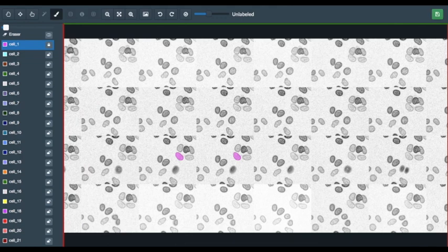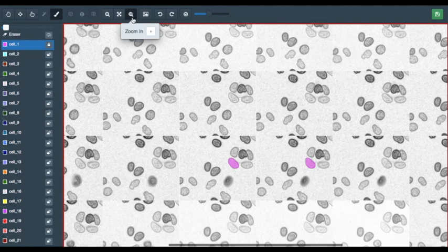If two cells are pressed into each other, like here, it is extremely important to color the cells different colors to show that they are, in fact, two separate cells.